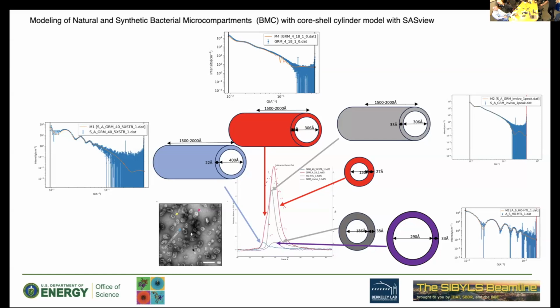But basically, we want to provide extra information to AlphaFold to improve its prediction. However, the limitation is still AlphaFold's algorithm. For example, AlphaFold 3 doesn't focus on flexible regions and has worse prediction than AlphaFold 2. So if the model's limitation is there, even though a SAXS curve can help it get correct conformations, it may not significantly change everything. We are trying to improve it based on experimental data, but not rewrite or retrain it. And we still need some time before we can.